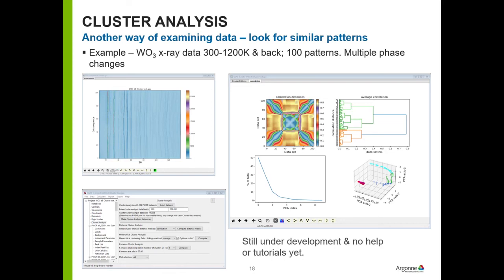So when you do the cluster analysis, you try to cluster these observations into common, similar patterns. One way to do this is a so-called dendrogram, which is what this is. And I happen to know that there are five different phases, so that's going to be that one, that one, that one, that one, and that one, splitting it up.